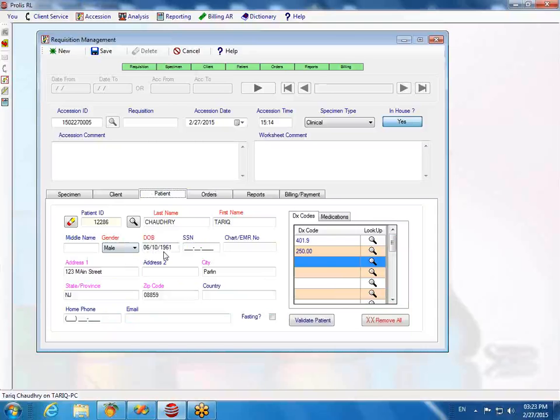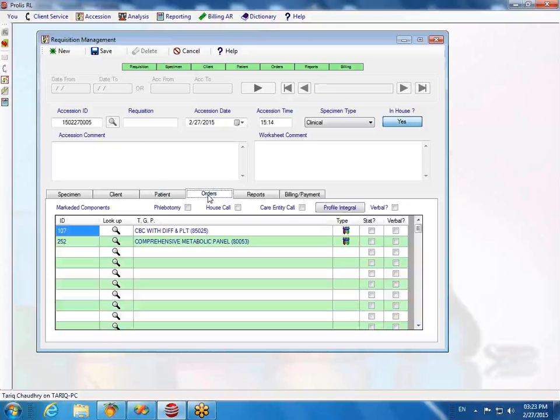So all these filters are programmable by you guys. We don't control that. When you set it up, for example, a LIS system here, would you enter all those features for a particular lab? No, we won't enter any of these features. We will teach you how to do it. You will do it yourself.